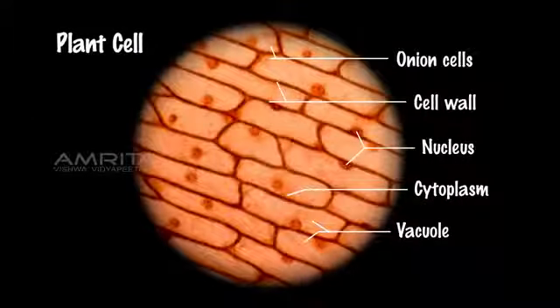Conclusion: as cell walls and large vacuoles are clearly observed in all cells, the cells in the observations are plant cells.